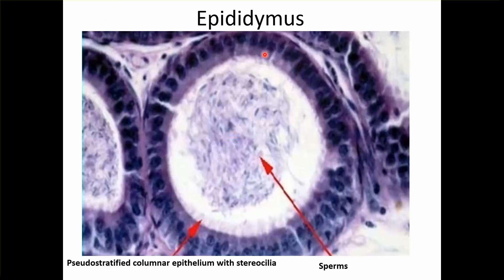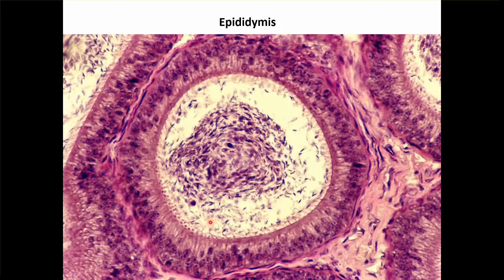This is the epididymis, in which you can see sperms in the lumen. The epithelium of the epididymis is pseudostratified columnar epithelium with stereocilia. It is actually one layer but it looks stratified to our eyes. You can see this cilia, which is called stereocilia, and the sperms in the lumen.